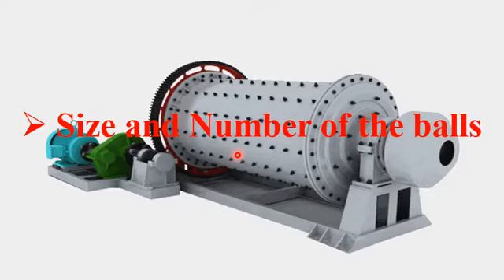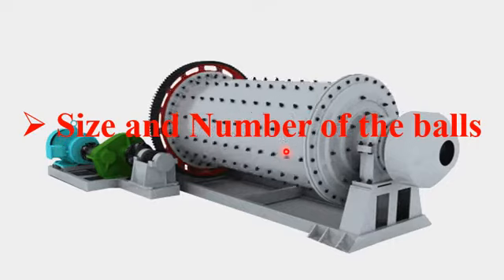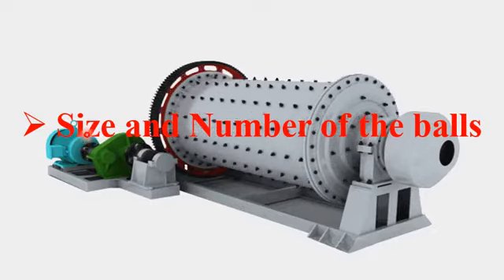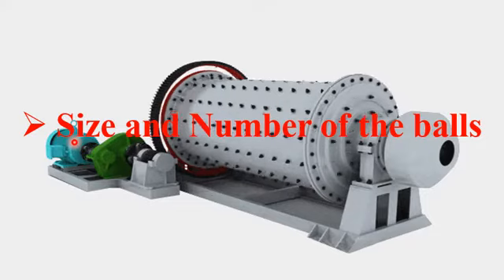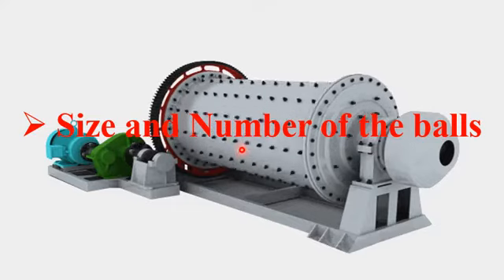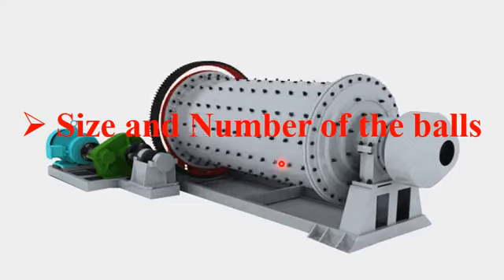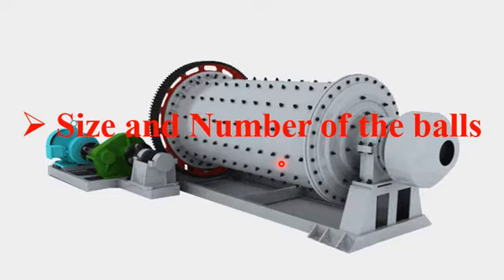So in simple words, dear student, the size of the ball and the number of balls used in the ball milling process play a very important role in order to get the desired nanoparticle. Please note that the sizes of the balls used are in the range between 20 millimeter to 150 millimeter, whereas the number of balls used is usually around 30 to 50% of the ball mill. So the size and the number of balls play a very important role in getting very fine, well-oriented desired nanoparticles.